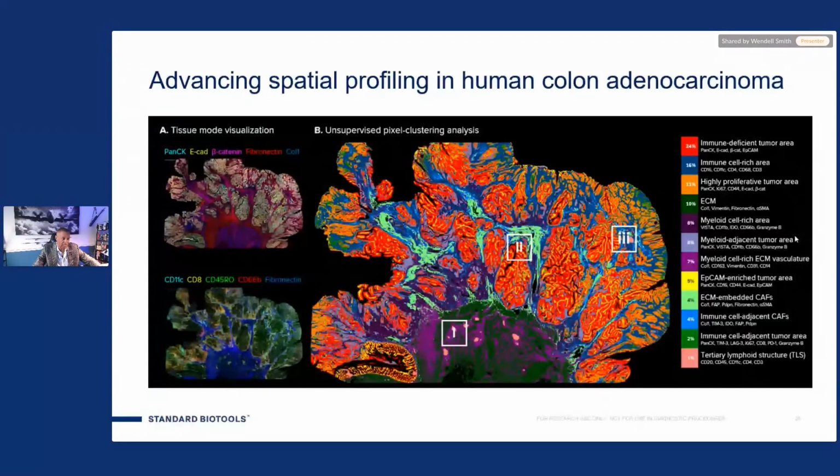Now I'm not going to go through each and every one of these, but you can clearly see how quickly we were able to generate data in each of these areas and provide the percentages. And as I said, this is a matter of minutes. This doesn't take a lot. That software is really just click, wait a couple of minutes at most, and then it's going to give you these percentages based on the areas you ask it to interrogate.